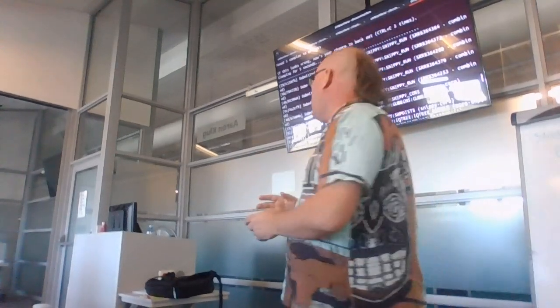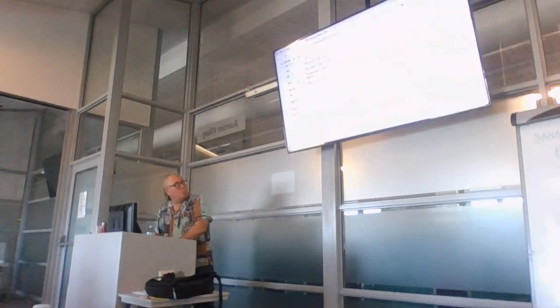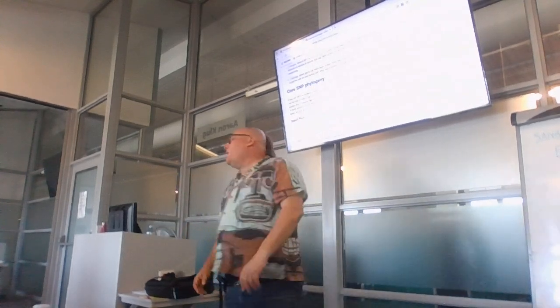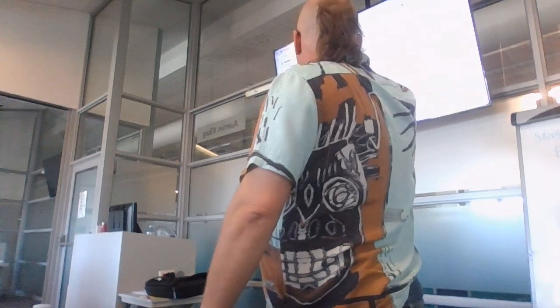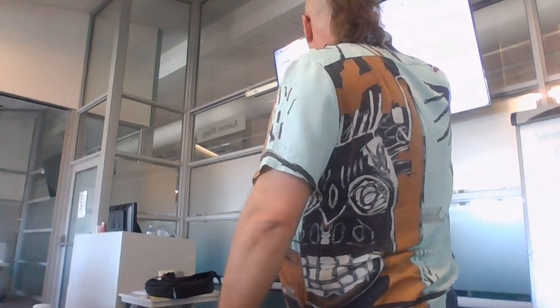Okay, that there's some information. So in other words, according to Torsten's description about Snippy core, if you call SNPs for multiple isolates from the same reference, you can produce an alignment of core SNPs which can be used to build a high resolution phylogeny. And the core site is a genomic position that's present in all the samples.